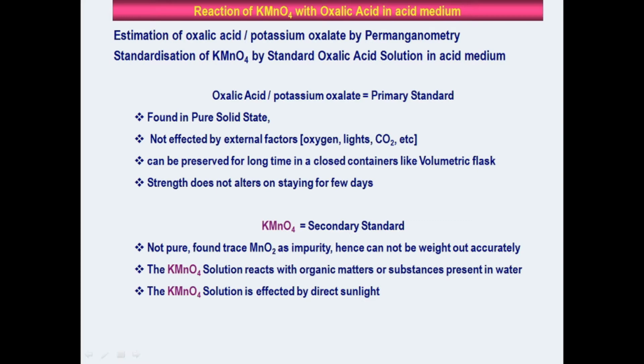Oxalic acid or potassium oxalate are generally called primary standard solutions since they are found in pure solid state and are not affected by external factors like oxygen, moisture, light, carbon dioxide, bacteria, etc. They can be preserved for a long time in a closed container like a volumetric flask, and the strength does not alter on staying for a few days. So they are called primary standard solutions and can be measured directly using an analytical balance.